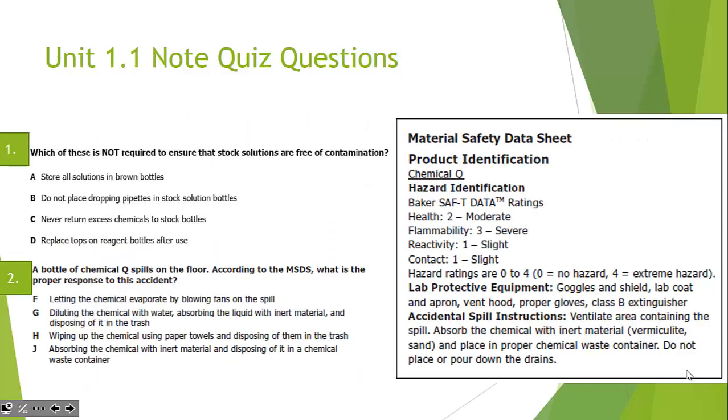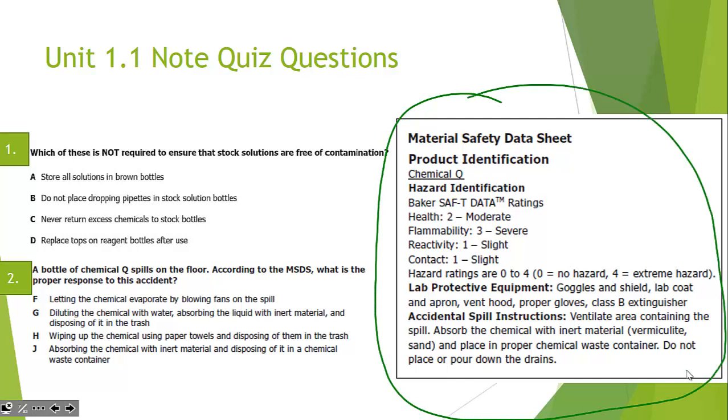If at any point there is an emergency in our lab, I will be responsible for handing the first responders a material safety data sheet. The material safety data sheet, or MSDS for short, are sheets of paper that contain all the useful information when dealing with all the chemicals in our lab. It is a full-out binder kept in the stockroom.